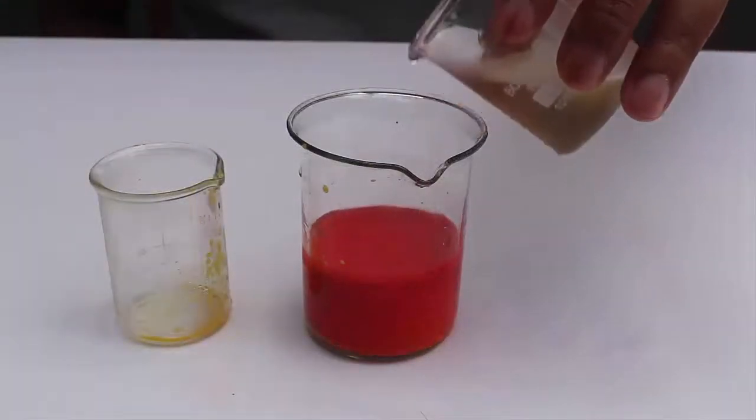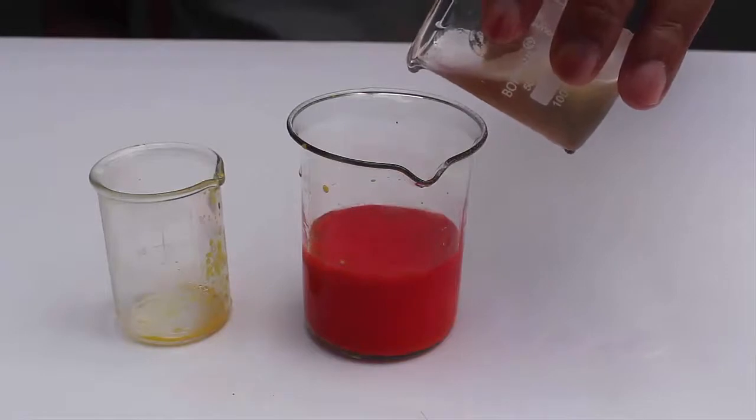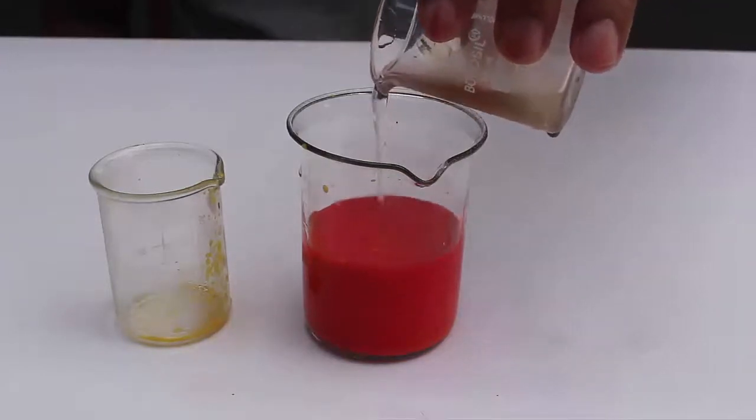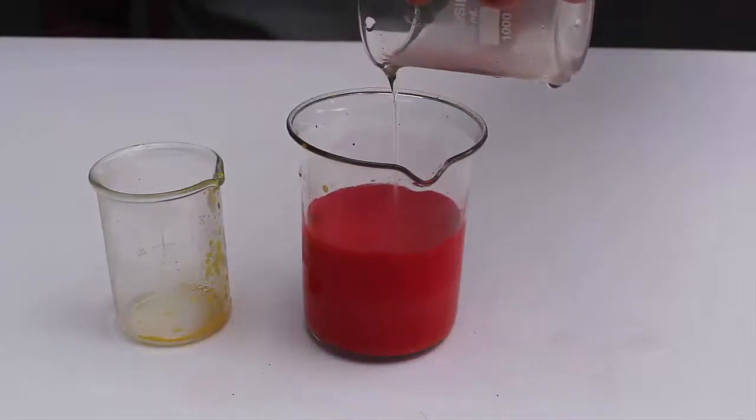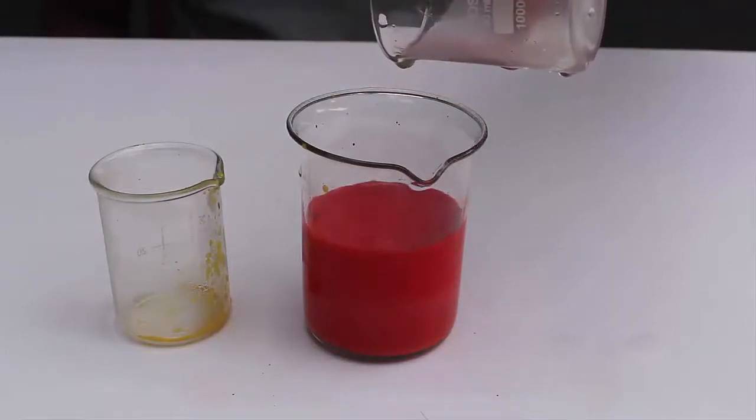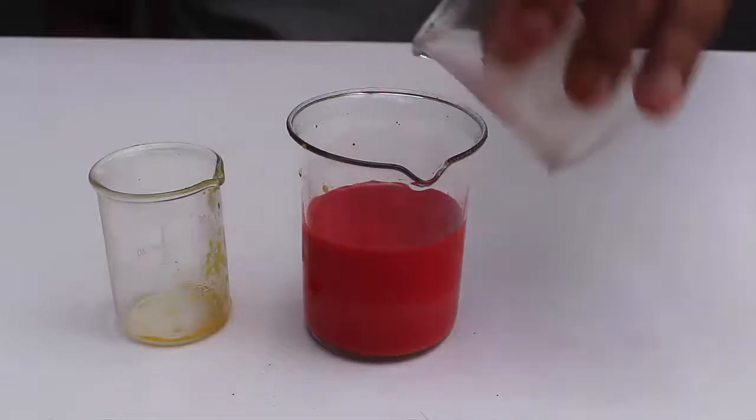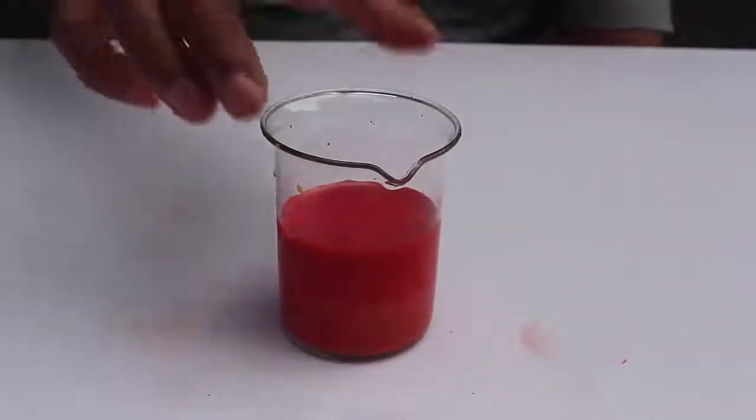A dye, a colorful dye is being created. This is the azo dye, A-Z-O. The azo dye is formed when aniline reacts with beta naphthol.